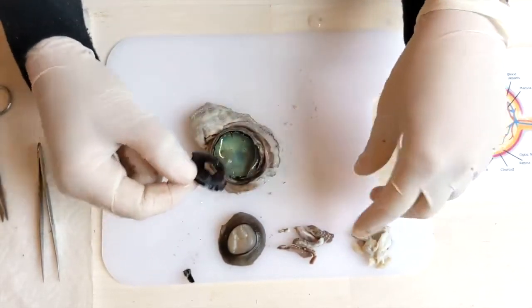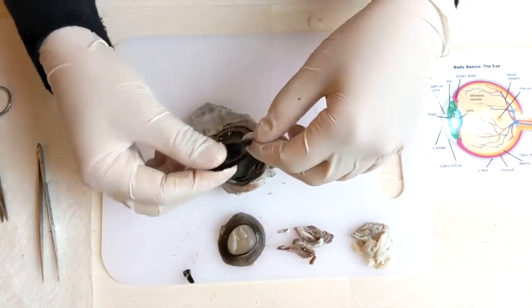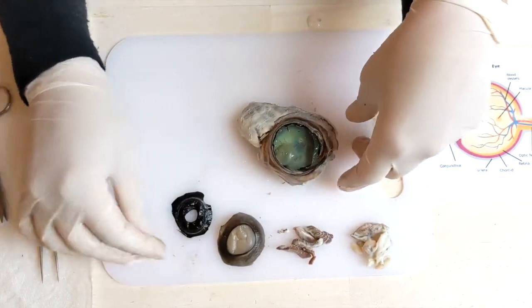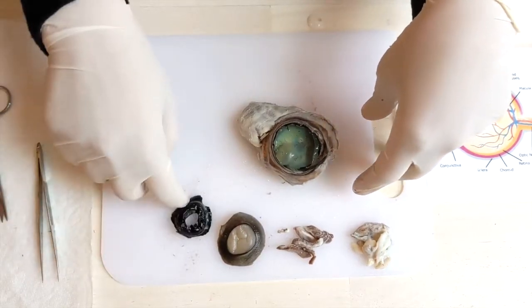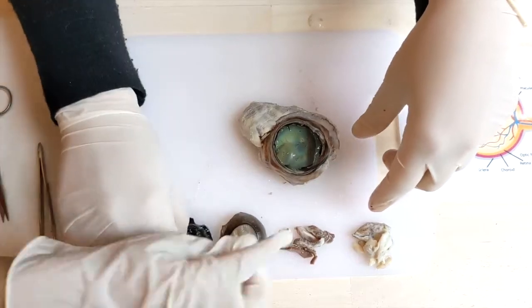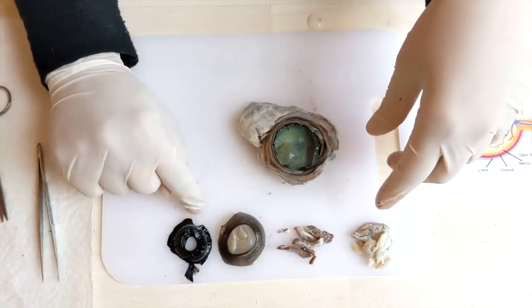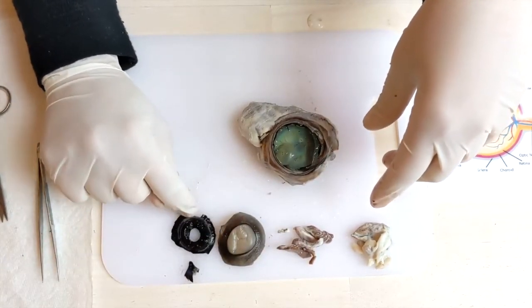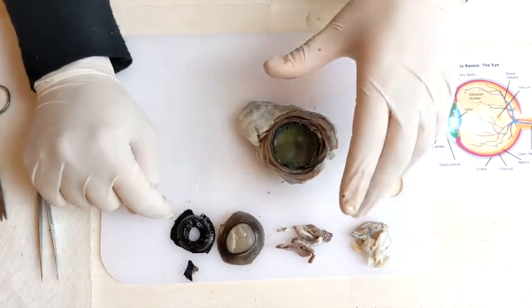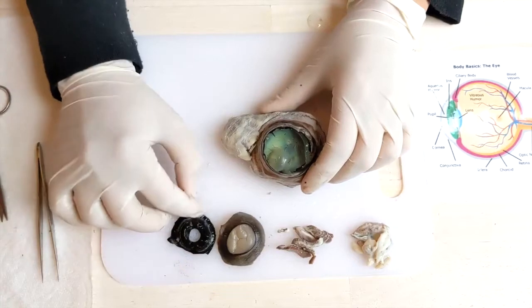I didn't know that. Yeah. So what was the first difference between a human eye and a cow eye? Cows have four muscles. Exactly. Good job. So this is a second difference. Oh, there's another difference, is that humans have different colors. Exactly. They can get different eye colors. So this is the third difference between cow's eyes and human eyes.